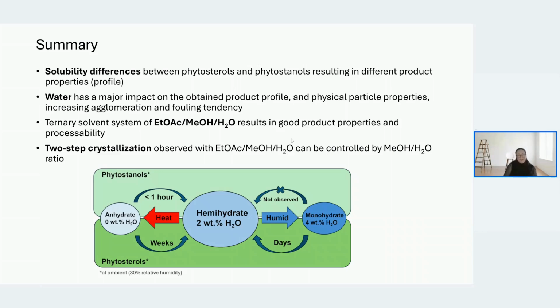But then we investigated these ternary solvent systems, for example, ethyl acetate, methanol, water. So practically that results in good product properties in terms of sterol-stanol ratio, but also processability aspects. The two-step crystallization that we observed is something that we could actually control by varying this methanol-water ratio. And we think that may have something to do with the hydrate formation at that particular high temperature. But there, it would be really nice to have some additional inline process analytics to study this phenomenon further.